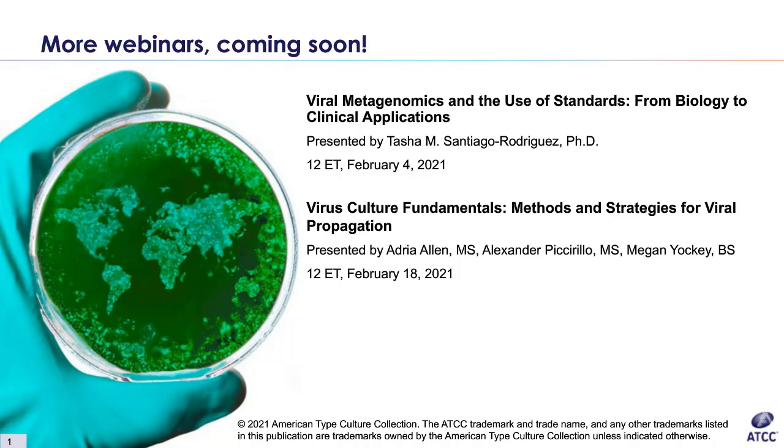When storing cells long term, we use our dewar, but we have it full all the time because they thought it was best practice. How full should a dewar be when storing mammalian cells? It's funny, when I first read this, I thought, how full should it be of cells? And I thought to myself, well, if it's ATCC cells, then it should be full to the top. But I guess they need the liquid nitrogen. So yeah.